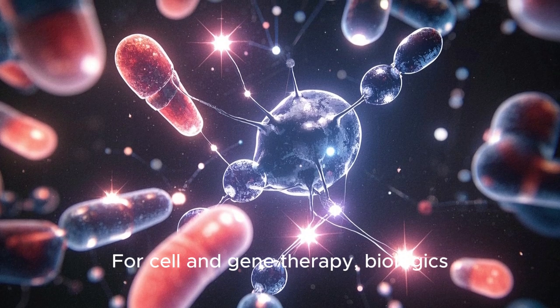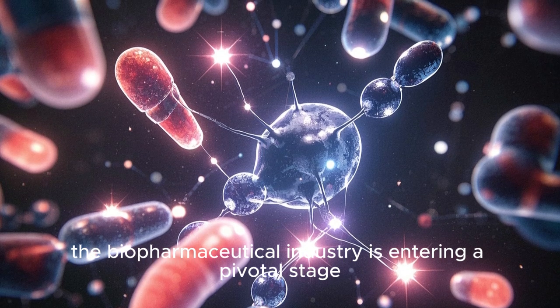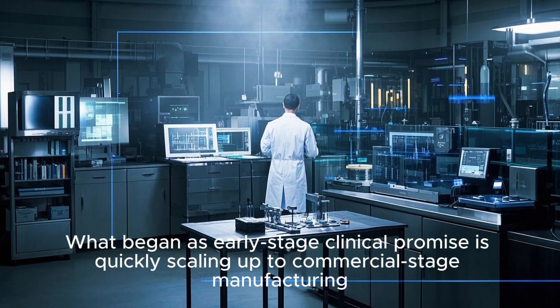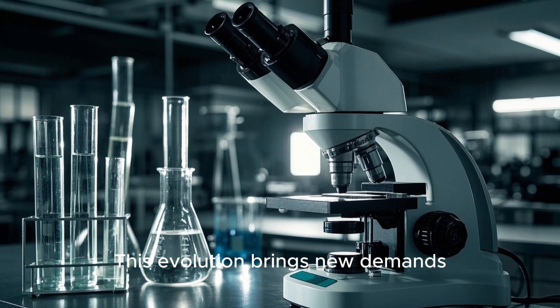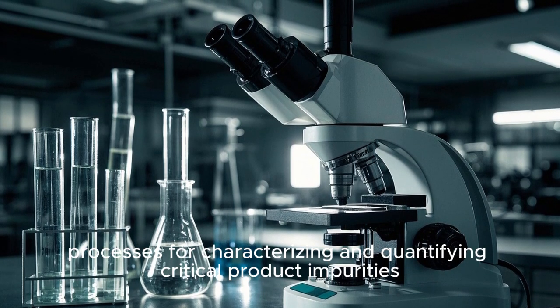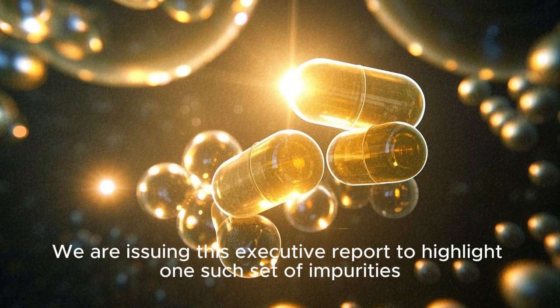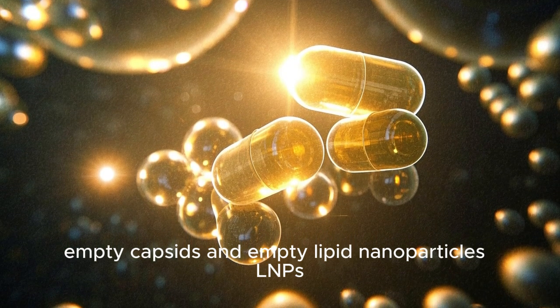For cell and gene therapy, biologics, and nucleic acid-based medicines, the biopharmaceutical industry is entering a pivotal stage. What began as early-stage clinical promise is quickly scaling up to commercial-stage manufacturing. This evolution brings new demands, especially around quality control (QC) processes for characterizing and quantifying critical product impurities. We are issuing this executive report to highlight one such set of impurities, empty capsids and empty lipid nanoparticles (LNPs).